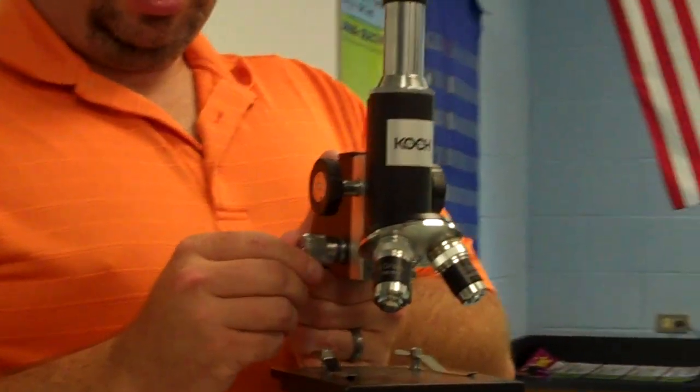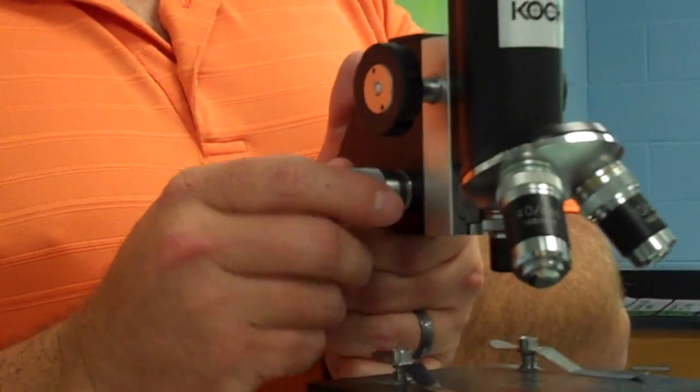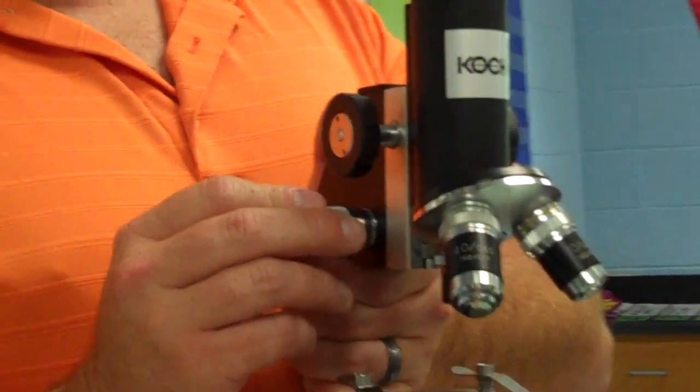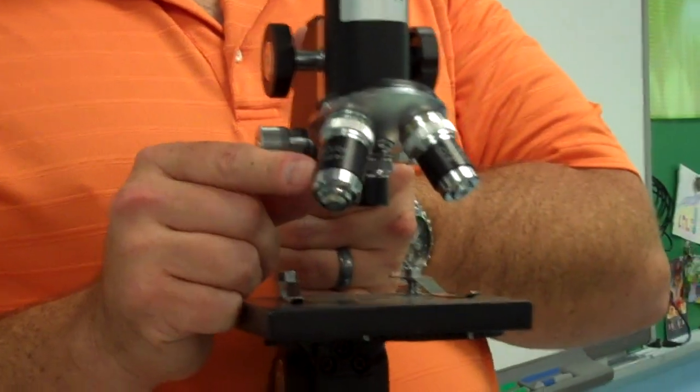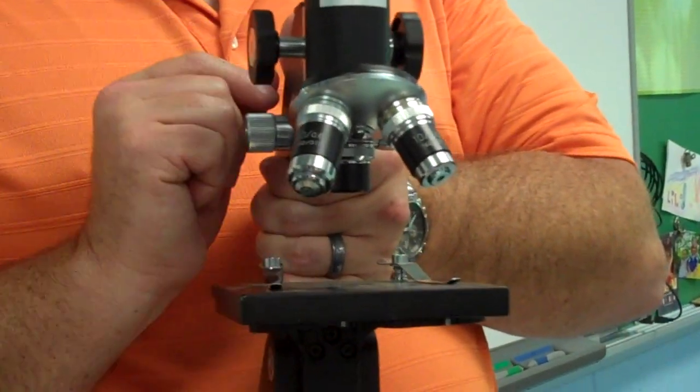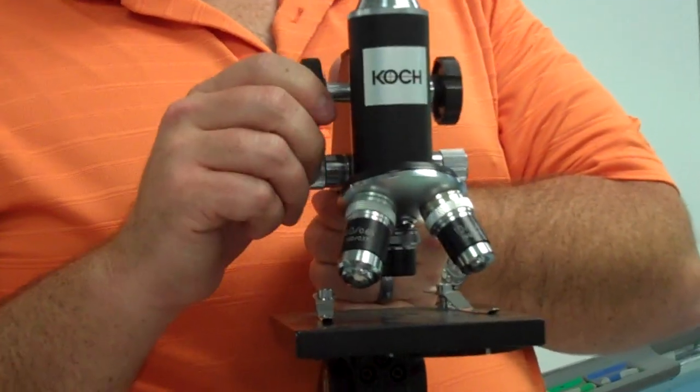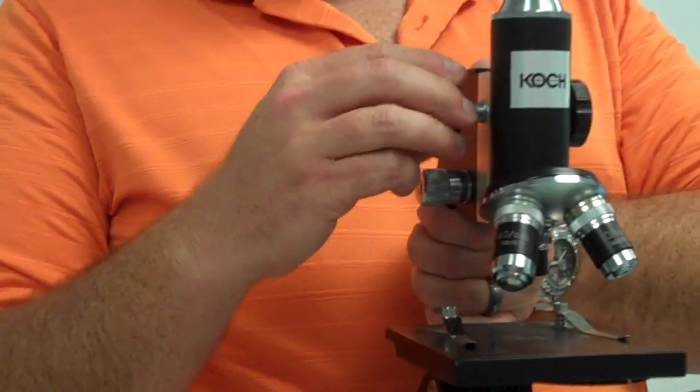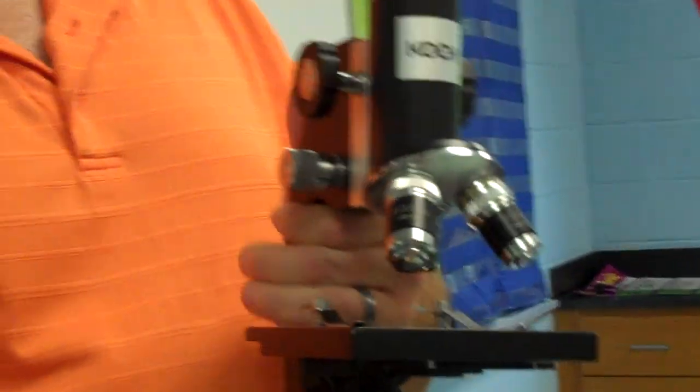The smaller knob is called the fine adjustment knob. This is a knob you will not really use too much. It's used more for higher magnification. And we don't want you using the 40x magnification lens unless directed to because there's a good chance you may crack the slide by having it go down too low. So the coarse adjustment knob allows you to focus the body tube in position. And the fine adjustment knob just kind of focuses that.